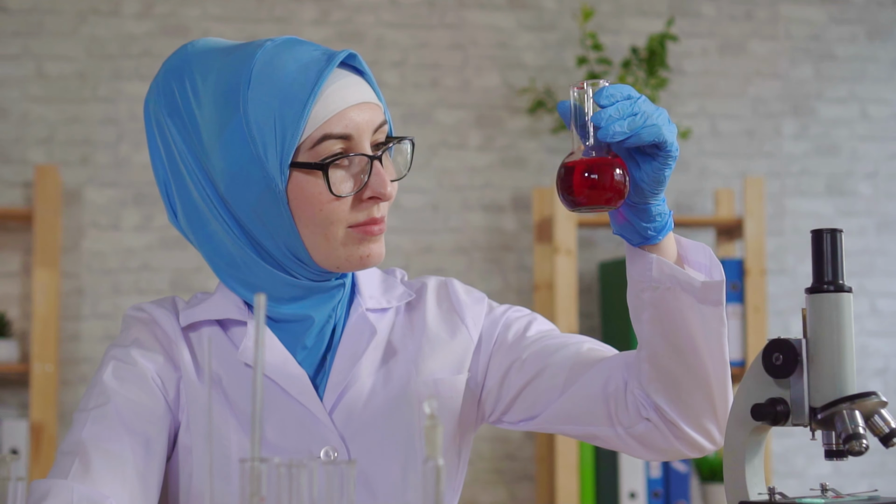To separate all of the fine particles, I've already said that I'm going to need a sheet of filter paper. But in fact, not all filter papers are equal. And in fact, I have 3 different ones here in front of me. And I'm going to put a similar mixture of soil and water into each. So, first I'll make up the solutions. I have 3 pre-weighed samples of soil and 3 beakers, each containing 80 millilitres of water. I'll add the soil to each of them, give them a stir, and then I'll pour each into the filters, and we'll wait and see what happens.